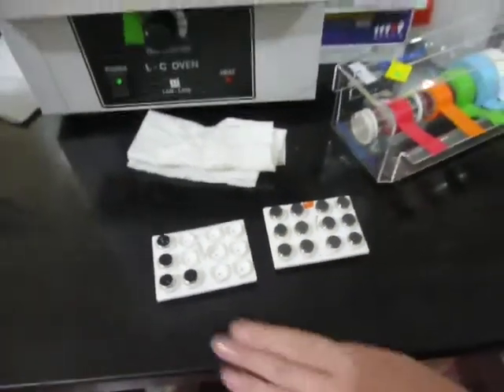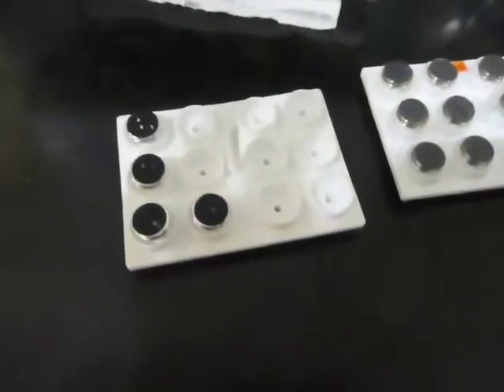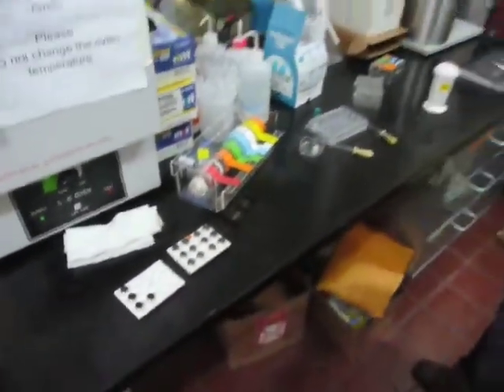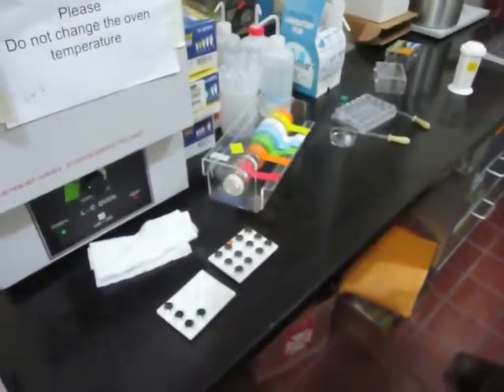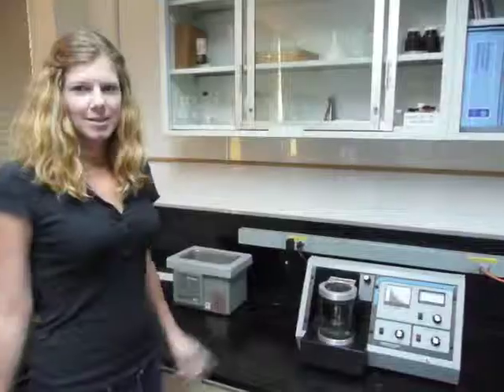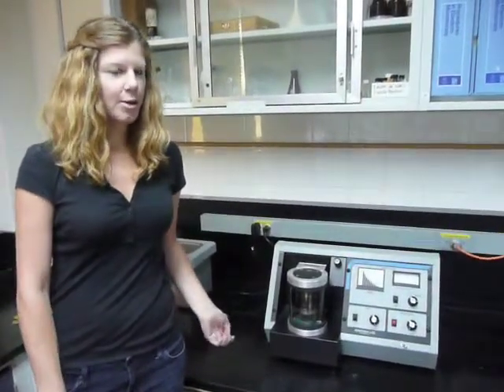After CO2 critical point drying, we mount the stubs. This is what the stubs look like after we mount, and then we will gold coat the specimens. That helps to stop any supercharging of the electrons and will also increase the surface resolution on the SEM.